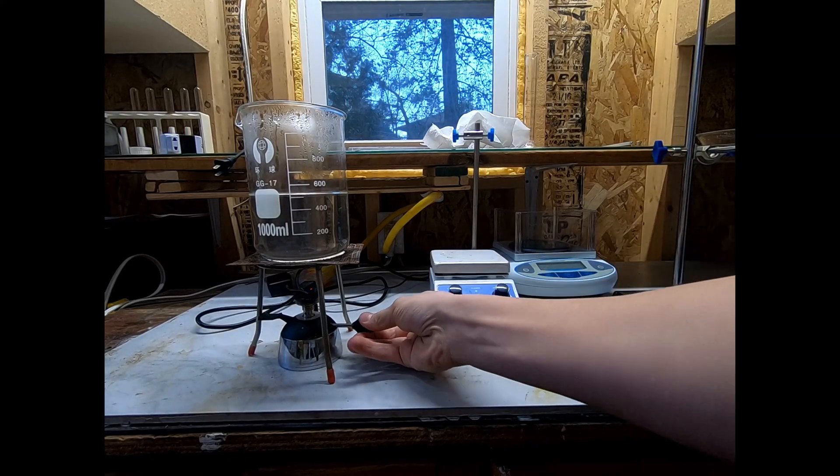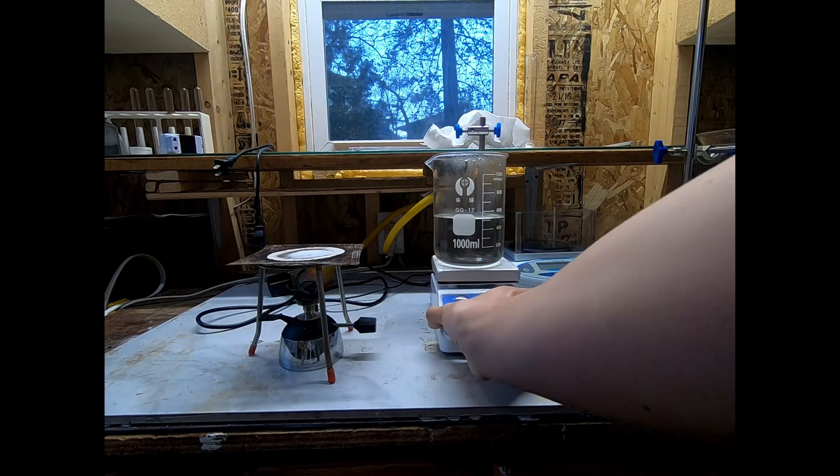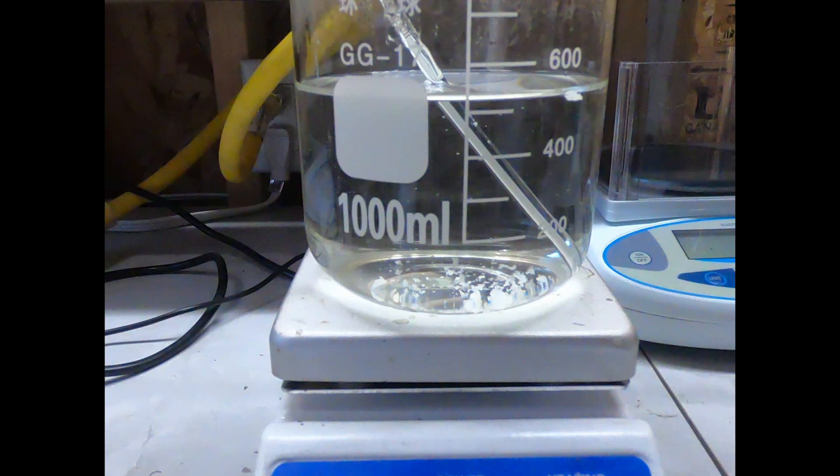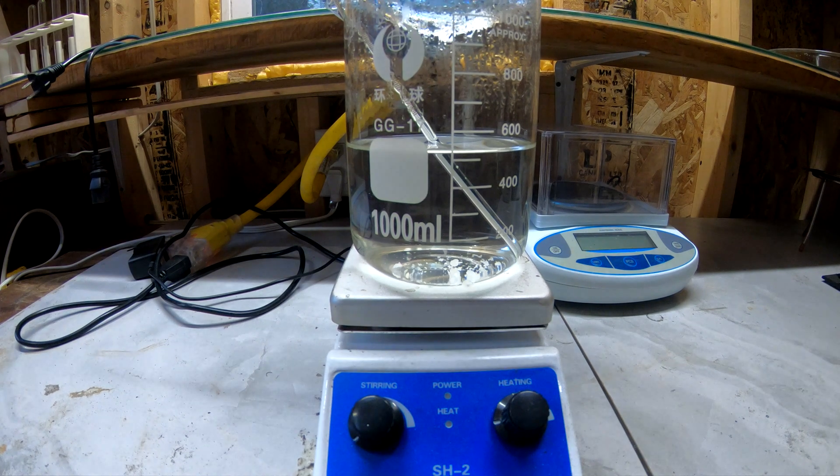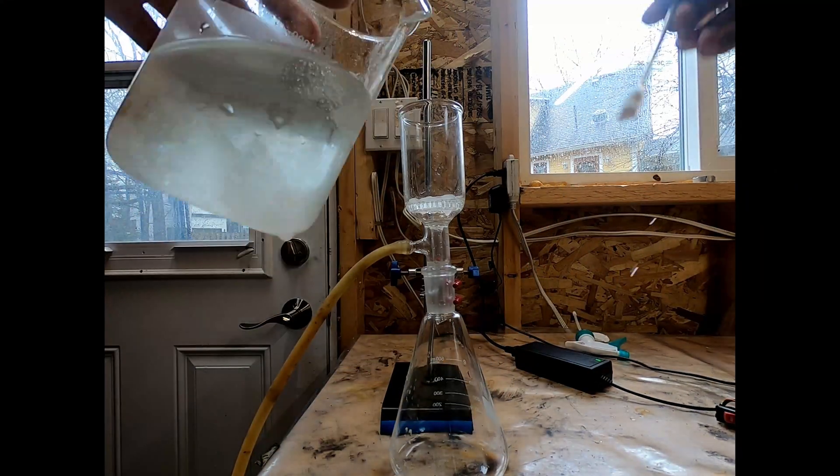Once I had evaporated enough water, I took the mixture off the burner and placed it on my now cooled hot plate to let it cool to just above room temperature. As you can see, some nice white crystals form. Once this happened I placed it in the refrigerator for several hours, which gave me a bunch of nice white sodium carbonate crystals.